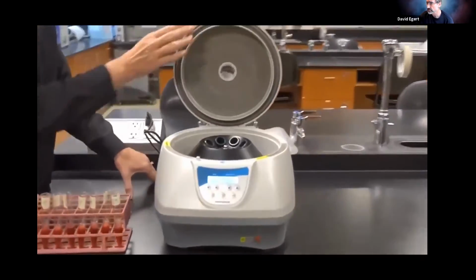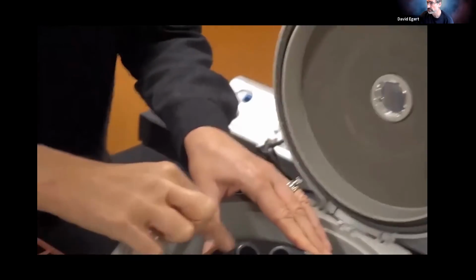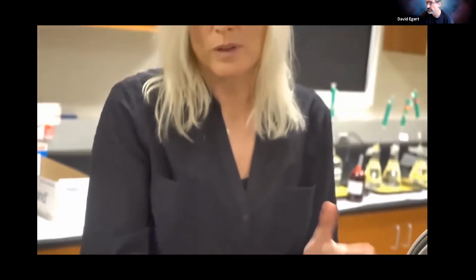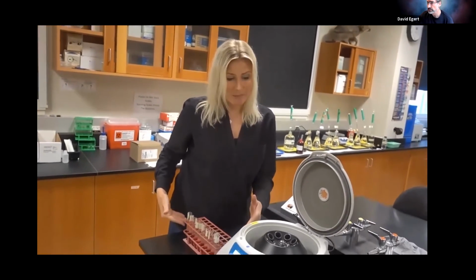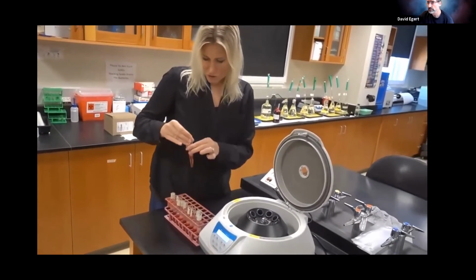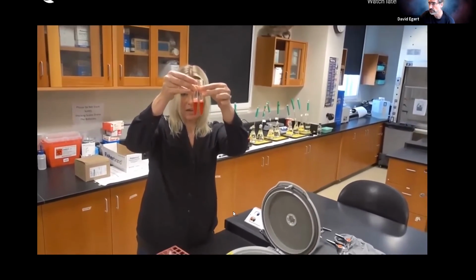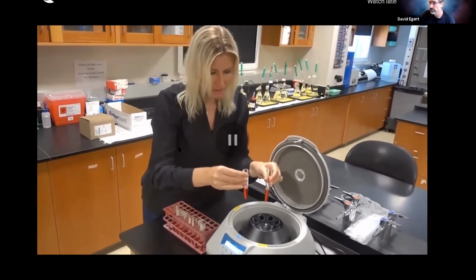And if we look inside, there are slots here that are numbered. But as David mentioned before, you should label the test tubes, because we're going to have to do this twice, and being organized from the beginning is key. Next, I'm going to make sure once again that everything is balanced, because otherwise this thing will not be happy. Remember, you double check yourself, because people are imperfect. You pipette and you mess up.